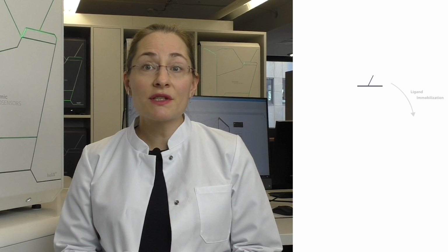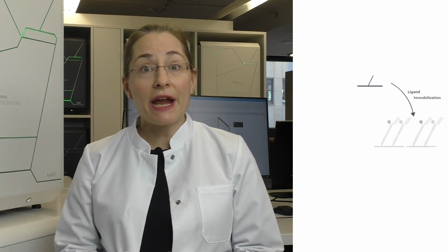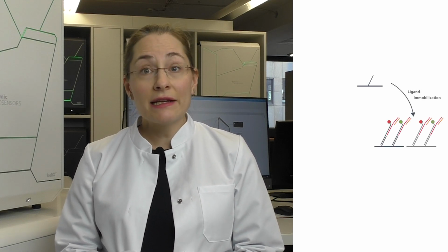Since multiplexing is saving us so much time, we will directly apply it in this tutorial. We can run the multiplexing experiment following the standard switchSENSE workflow. We always start with the immobilization of our ligand or ligands on the fresh sensor surface. In our case, we would like to immobilize 4 different double-stranded DNA oligos as overhangs of the nanolevers. These ligands will be our targets of interest.